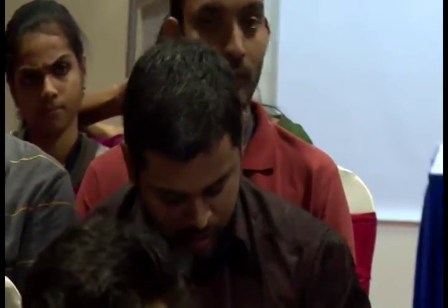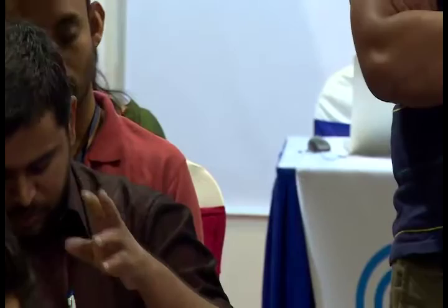Okay, thank you. And the other question is with respect to your SPEMS program, which you mentioned, the algorithm. Could you please get back to that formula and just explain the terms in that? Oh, you mean how to simulate experimental images. Yes. The SPEMS program is not publicly available simply because Greg, who wrote it, has not finished it.